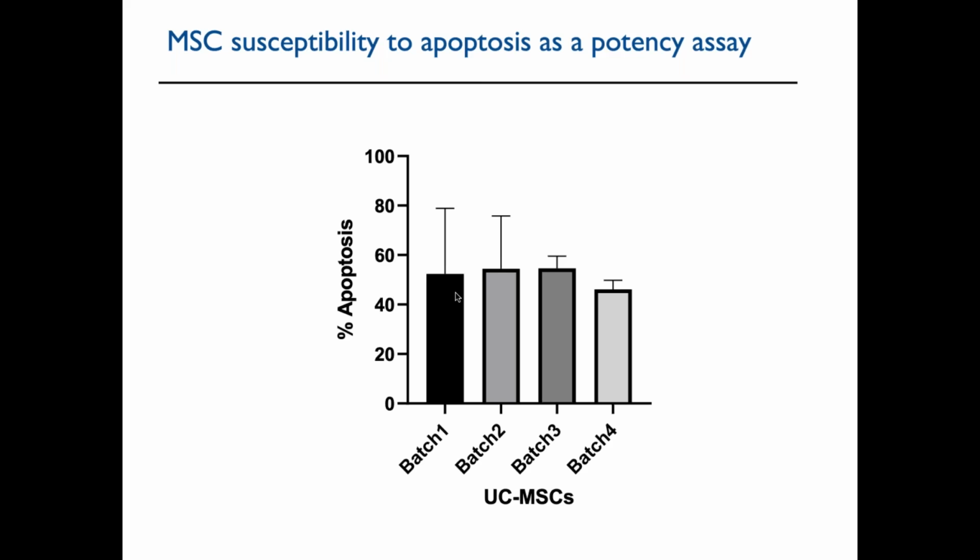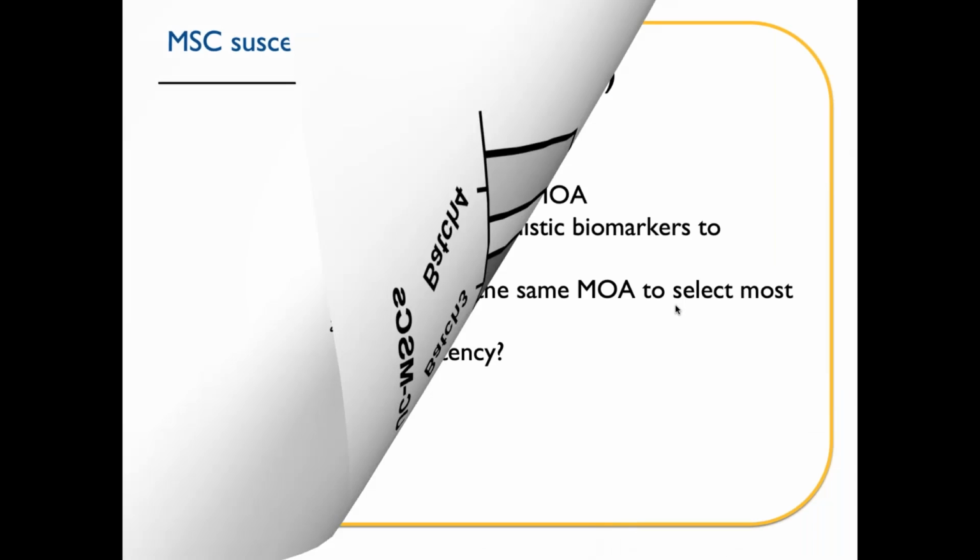We currently select our MSC batch according to the ability to be killed by standard activated T cells. These cultures must demonstrate that MSC undergo apoptosis in at least 43% of the cells. With this, there is still some variability, but at least we have a fairly homogeneous cell batch that is driven to elicit the mechanism we have investigated.